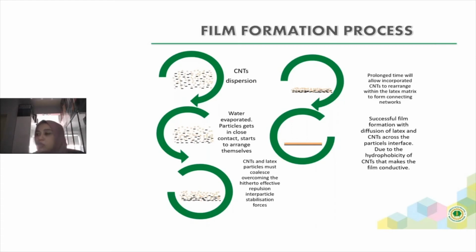that is the effective repulsion that occurs during the drying time or the film formation process. So for a long time, we allow the incorporated carbon nanotubes to arrange themselves within the latex matrix to form the connecting network. This is important to get the conductive properties, because the connecting network is crucial.